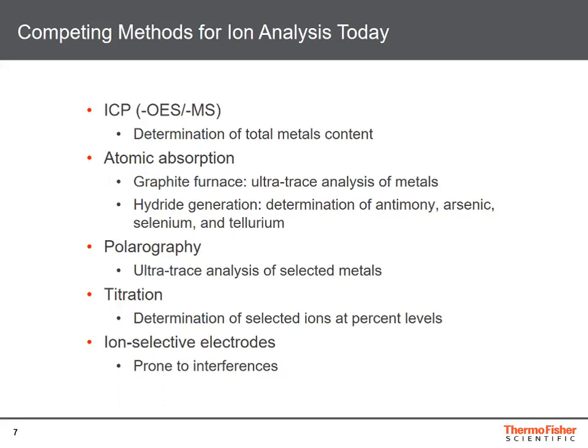Polarography as an electrochemical method is still quite popular, especially for the ultra-trace analysis of selected metals down to the nanogram per kilogram level. Although polarography is not really a multi-component technique, usually more than one metal can be analyzed simultaneously.